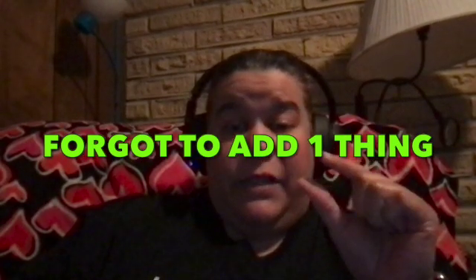Little thing that I forgot to mention. With the starch digestion, remember that your bacteria are sitting on top of your agar, and they can only digest so much starch along that surface. If the agar is very thick in that plate, once that iodine settles and starts to sink into the agar past where your bacteria have actually been able to digest the starch, that agar is going to turn black.